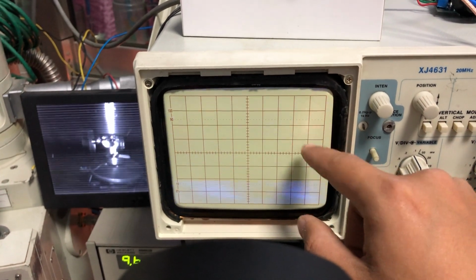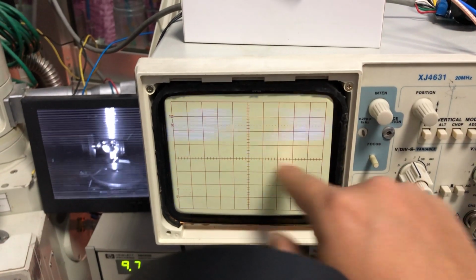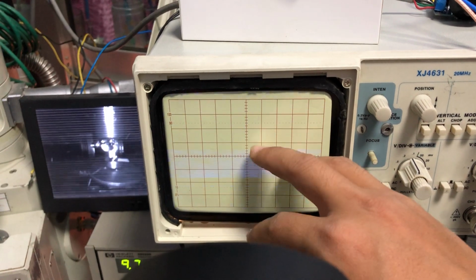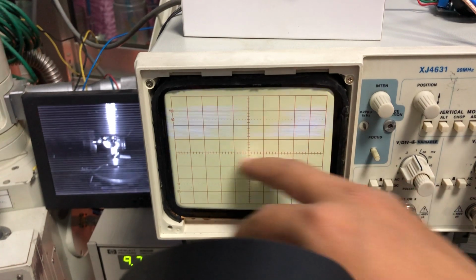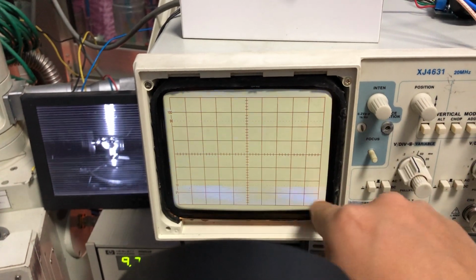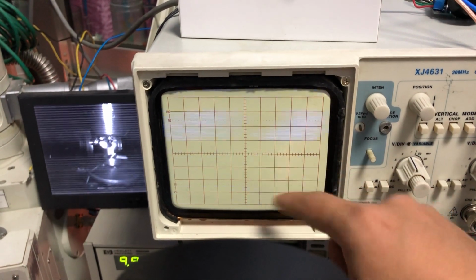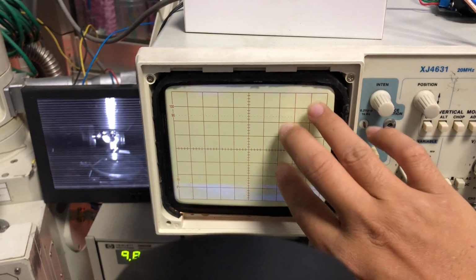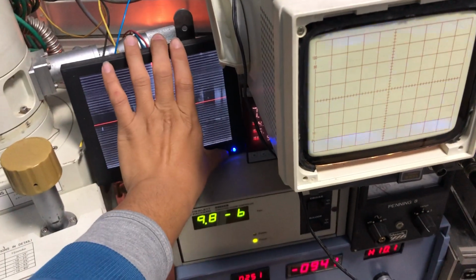But in this one, when the scan line passes through this area, the persistence can stay for a very long time. Before it disappears, the scan line starts a new scan again, so you can see the image continuously on the phosphor of this screen.